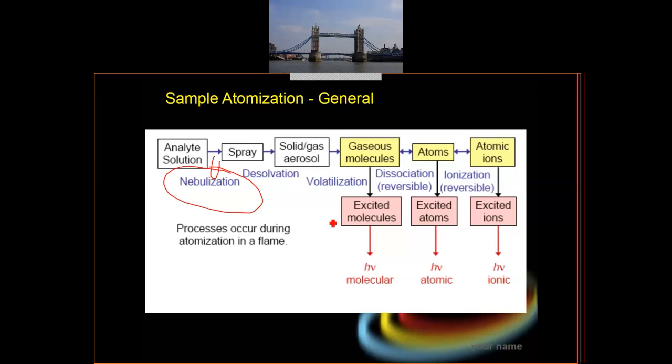But in this case, it uses a small opening, just like when we use pipes to water the plants. We want to make sure that it goes further, not just near us. So we reduce the size of that water pipe opening, isn't it? Make it smaller, and then that water will go further. We increase the pressure actually, but the water will be small and you can see some droplets.